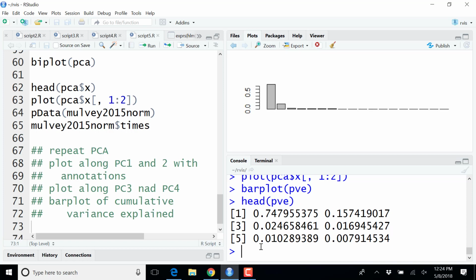And now, later on, we'll see, I produce a lot of PCA plots for my research, and as part of the packages I develop and maintain, I have a helper function that very easily produces all these PCA plots with tons of different types of annotations I want, and that's the kind of annotation it adds to the plot. And I'll show you later on how to do it. But it's important to know where these values come from and understand how the algorithm works. And afterwards, you can find a helper function that does it for you.